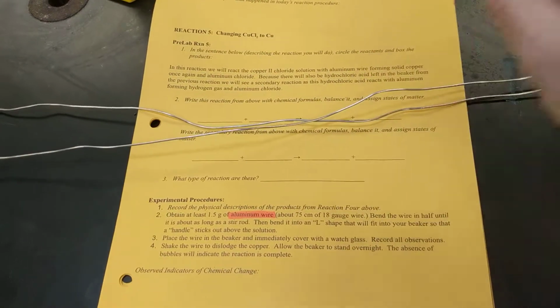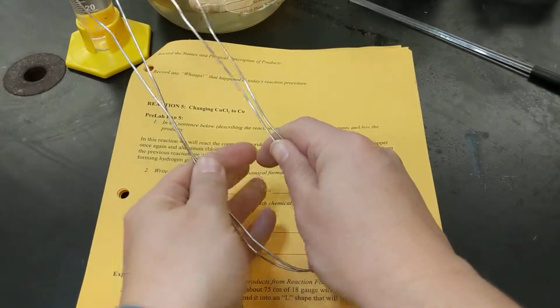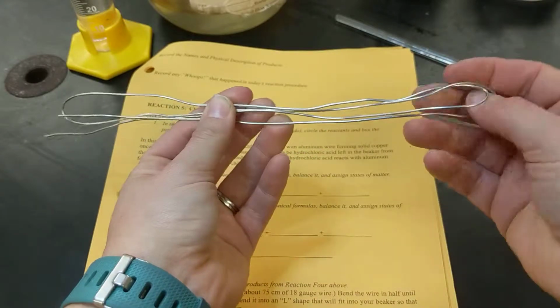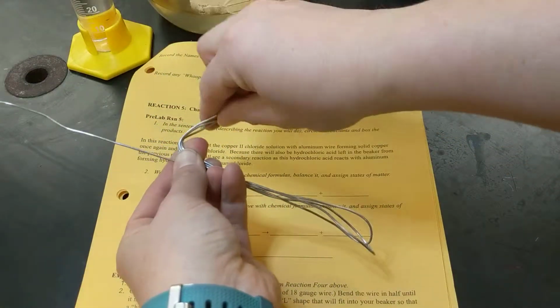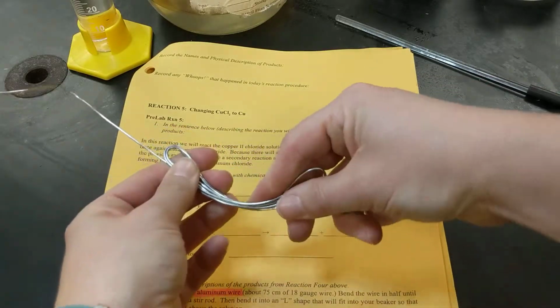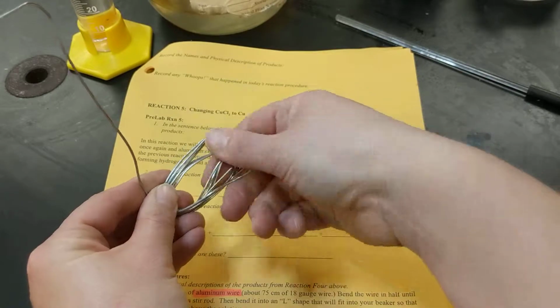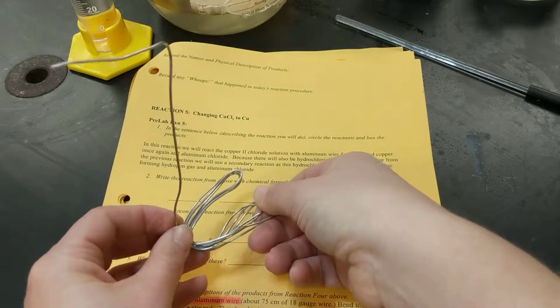Your aluminum wire that you get is nice and long, okay, and I folded mine in half. You're going to fold it down and in half until it gets to be about the length of a stir rod. So here's my stir rod. They're about the same length. You could even fold it one more if you wanted. We're going to have just a handle, so we're just going to have one of these sides come up. Then we're going to bend this other part down, and this is like my handle portion. We're going to turn this into an L. So that means that this is where our copper is going to form. It's going to form on our L here. Our copper is going to form on this aluminum, and we're going to put that down into our beaker.